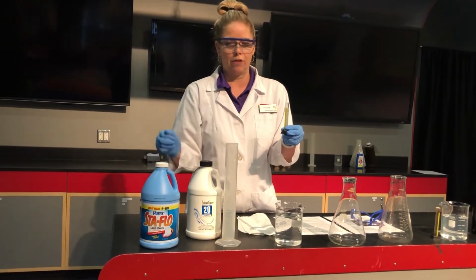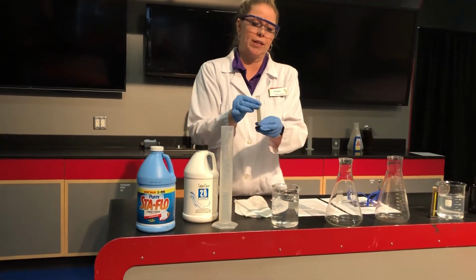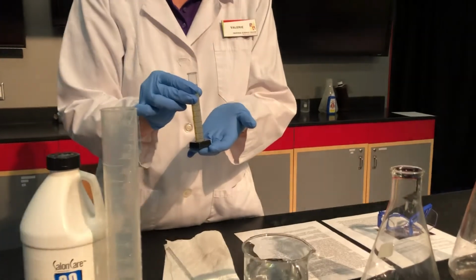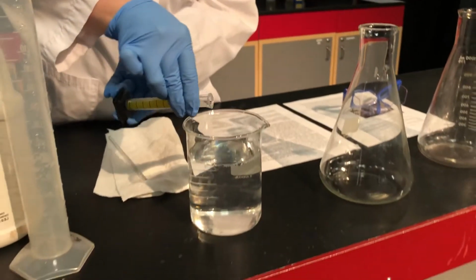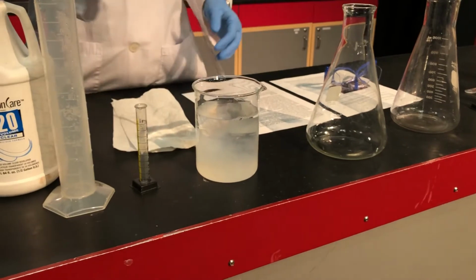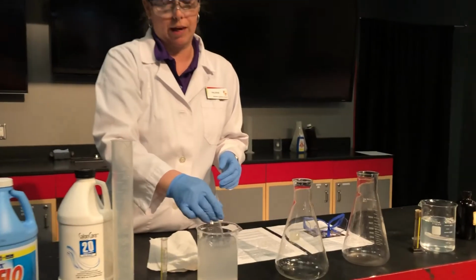Starch you might have used in your slime recipes at home, but it's often used in laundry to get wrinkles out. And we are going to add 10 milliliters of this liquid starch to our hydrogen peroxide and water solution. So you can make a guess right now whether you think anything's gonna happen. Here we go, I'm gonna add it in. And I'm gonna stir it up just a little bit, but pretty much you'll see it's a little cloudy, same color as the starch, but not much else has happened.